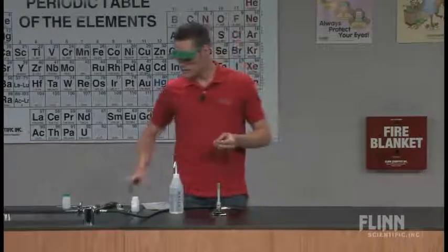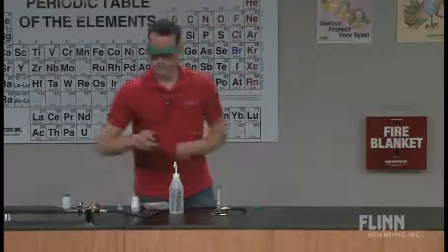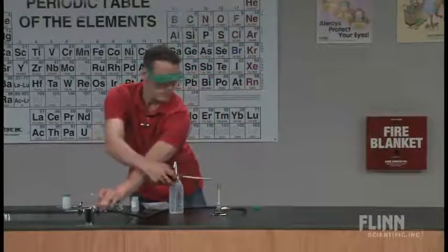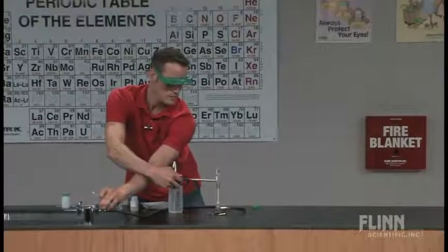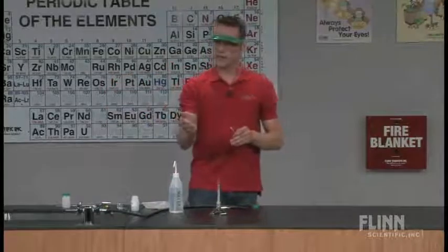So we are going to need to dim the lights just a little bit. Let me light the Bunsen burner first. And I always tell my students, hold the flame test on the outside edge of the flame. Don't go for the cone in the middle.